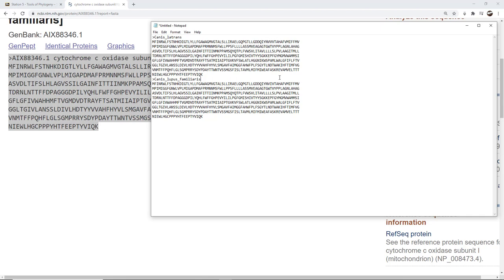So I would keep doing this for all of the organisms that I'm interested in doing an analysis of. I might have just a few dozen, or I might have hundreds — it depends upon what I'm going to analyze. After this, we're going to take this Notepad sequence and put it into ClustalW. There are a number of programs, but for our purposes we're going to use ClustalW online, which allows us to do this all online without having to download a separate program. I'll add a few more sequences so we can see how it all works when we do the analysis.